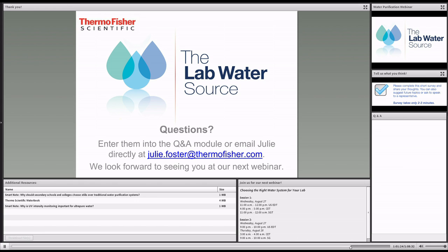Our next question, which hopefully will have an easy answer: When the ions are getting exhausted, does the water purity fall immediately or slowly? And how can we know if cartridges are getting exhausted by looking at the values? Yeah, it'll go immediately. It's not a gradual thing. If you have an ultrapure water system, you're used to 18.2. You won't come in the next day and see it at 16 and then 15. It'll be like 1. It really will drop off very quickly. So as soon as it does that steep drop off, it's time to change the cartridge.